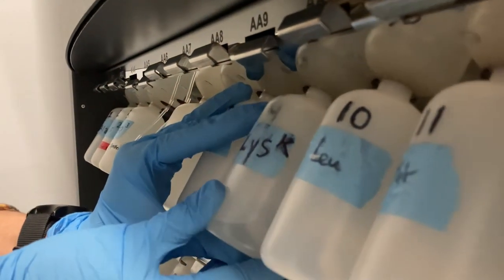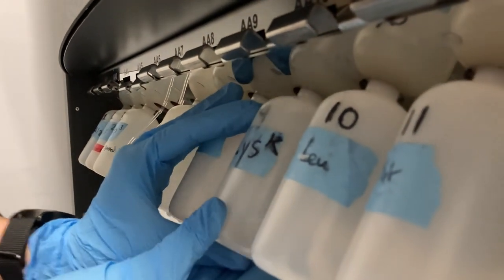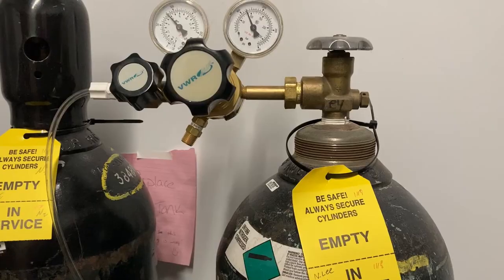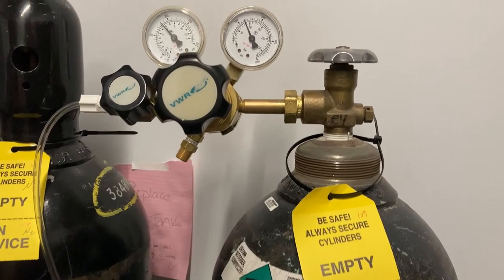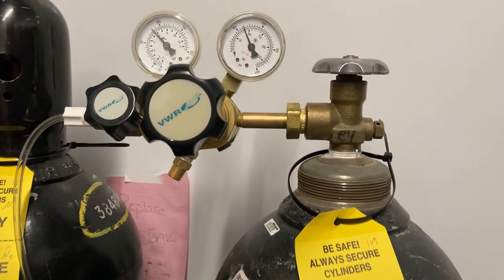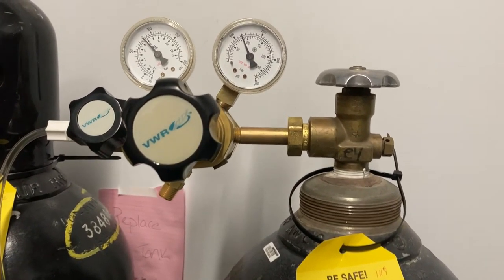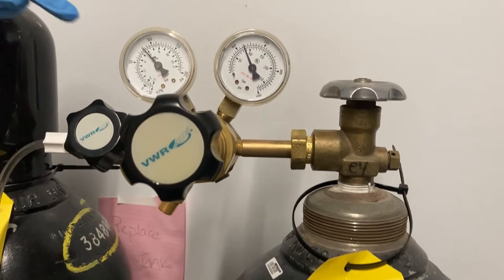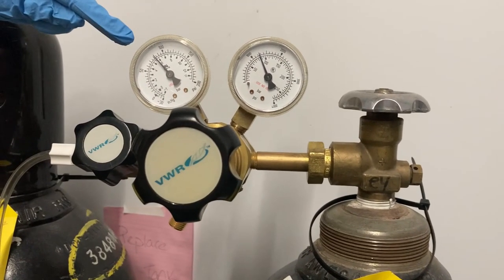Before you pressurize the bottles, check the regulator on the nitrogen tank. The right gauge shows how much pressure there is inside the tank. The left gauge shows how much pressure there is leaving the tank. The left gauge should be set to 88 psi.